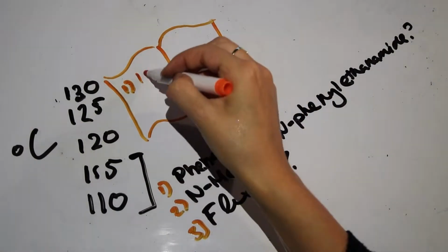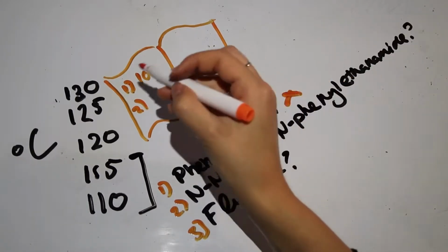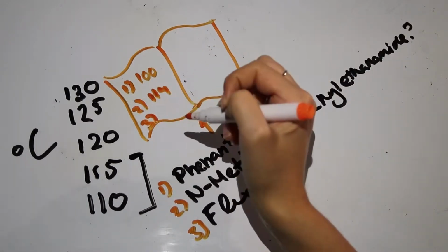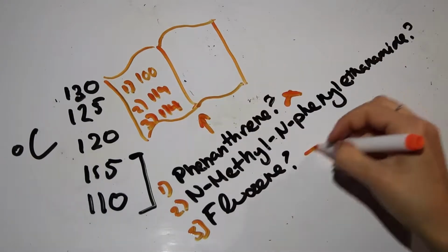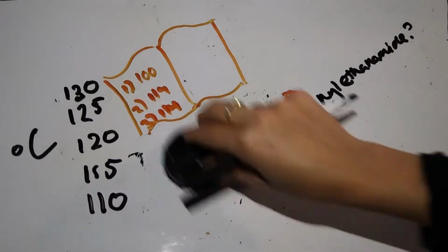Of course, this doesn't guarantee that your substance has been correctly identified, as there are millions of solid organic compounds around us, and most have melting points below 250 degrees C, so you're likely to discover two completely different compounds with almost identical melting points. As a result of this, it is fundamental to use experimental melting point values as only one piece of data to support the identification of an unknown substance.